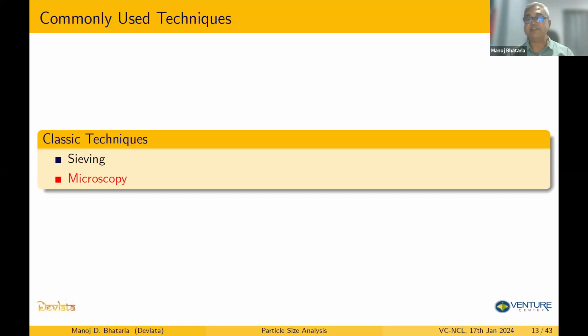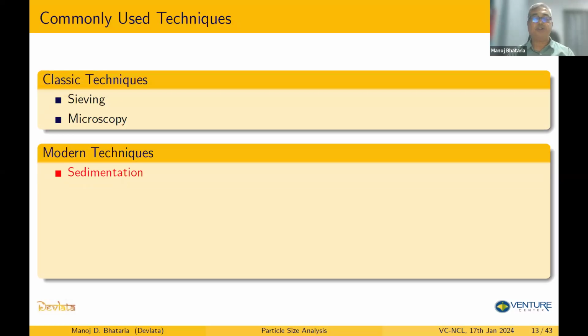Now there are automated techniques. There are basically softwares to do that for you. But still, people use these techniques tremendously. In the more modern techniques, we have sedimentation, both gravity as well as centrifugation.